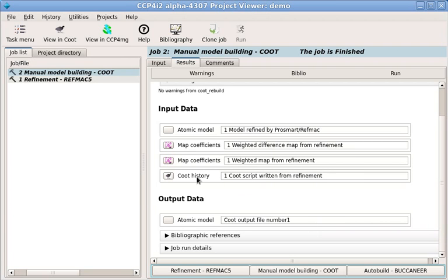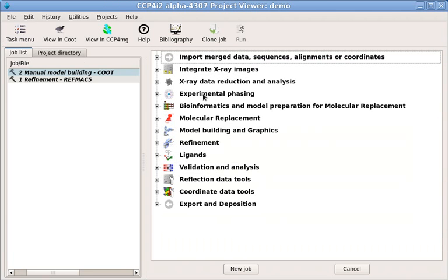For more information, most tasks have their own documentation pages, which you can get to with the Help button. You can also ask questions on the CCP4 Bulletin Board.